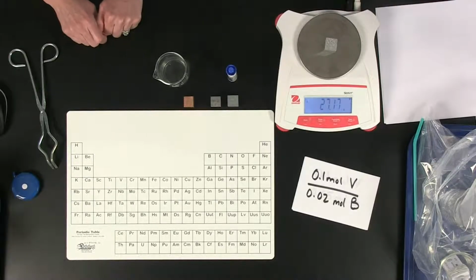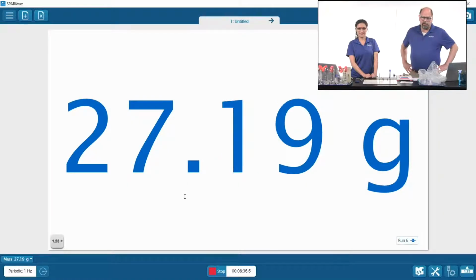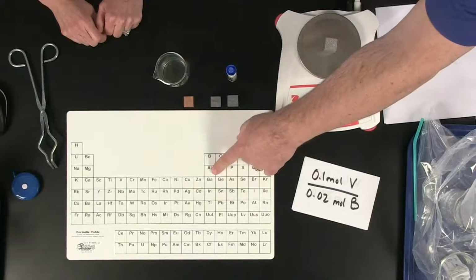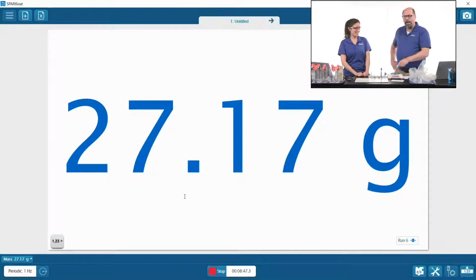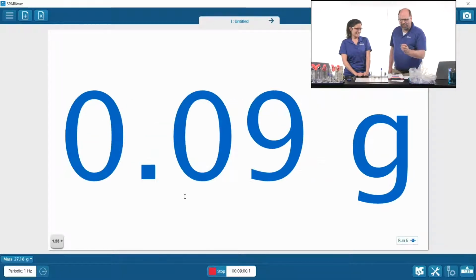Right. And if you pick up a periodic table, while this is simple, you can see this example of our periodic table on the desktop here. Usually you'll see a number right underneath this, and non-coincidentally, that number is going to match exactly what we see 1 mole weighs on the scale. The atomic mass on the periodic table ends up being the same as what 1 mole would weigh, and that makes it far easier to count out that number, 602 hextillion particles in each of these sort of cubes.